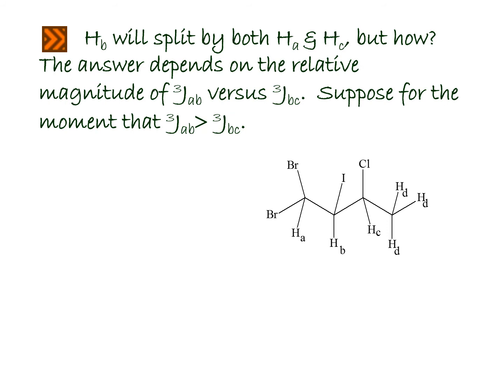HB will split by HA and by HC, 3 bonds and 3 bonds.